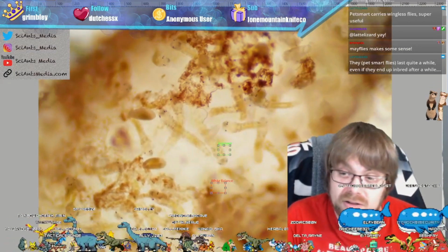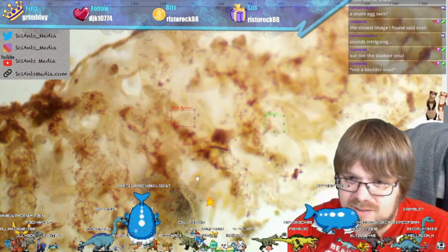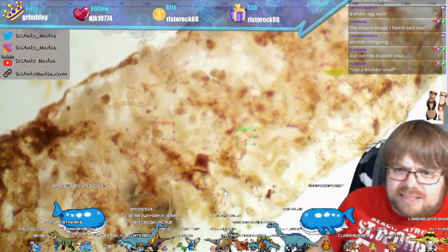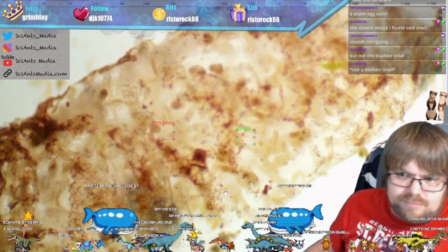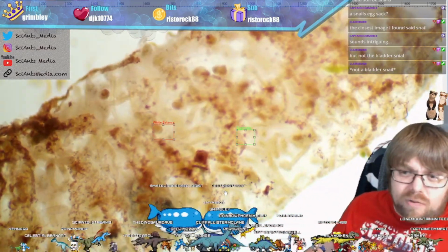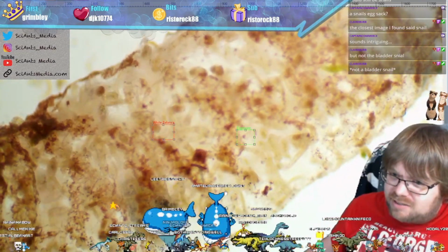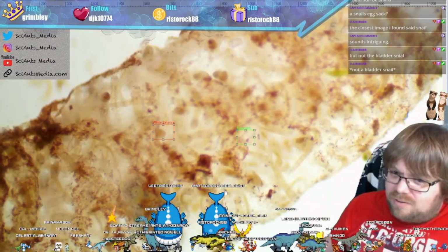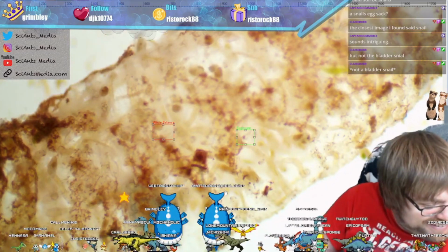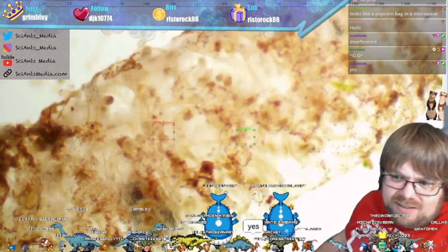So we're getting a little bit distracted with it. Look at all that activity in there. There could be some nutrients that they're eating inside of the egg sac, or maybe they need to continue developing. This was overnight, because when we looked at it yesterday, there were still beads on a string. And now, I don't know, it makes me itch a little bit. It's a little unsettling, right?